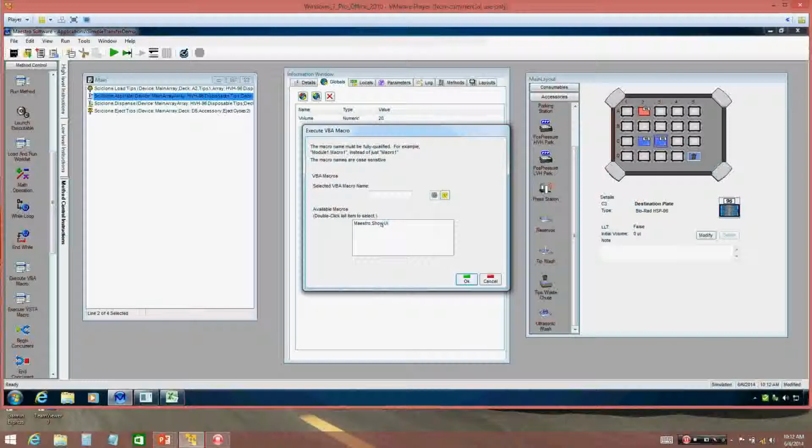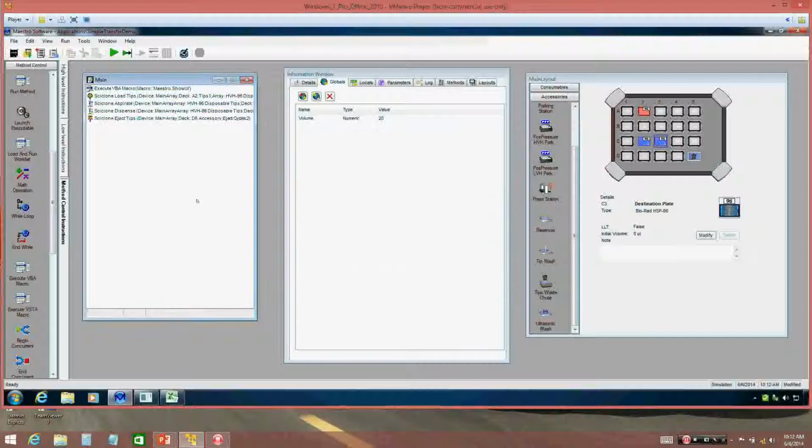So when I click this in the beginning, if I were to click this run button, you may notice this is that form that comes up, and in the background it says 20. Well, let's make this, for example, 70.